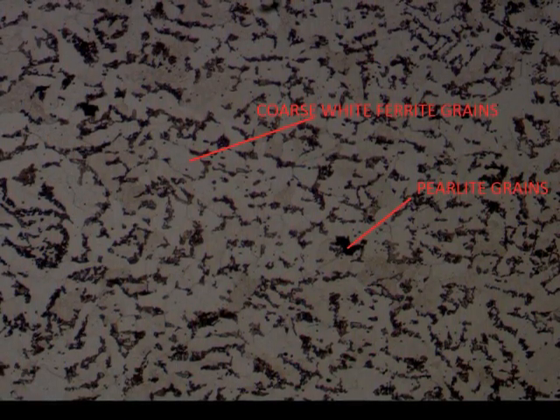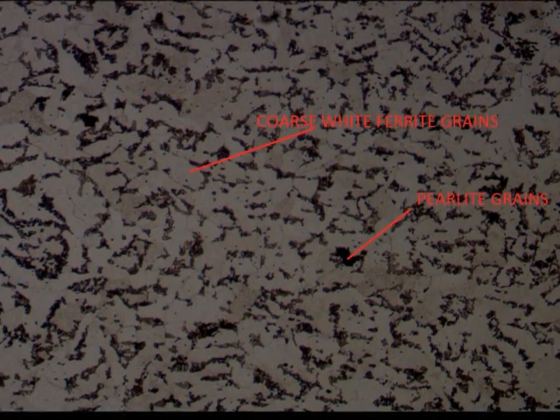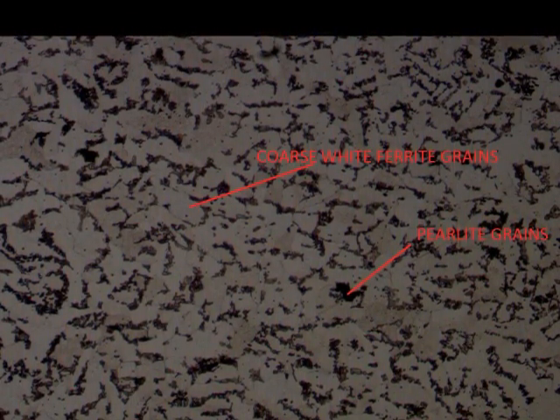So, the next one is the heat affected zone. In this zone, the solid state transformation has occurred such as grain growth, recrystallization, grain coarsening, annealing and tempering due to which it has a coarse grain structure. This zone is close to the weld fusion zone. It contains the grains larger than those in the low carbon base metal.